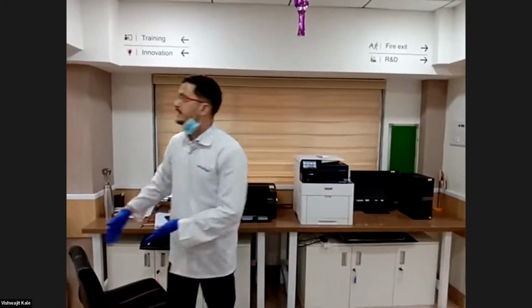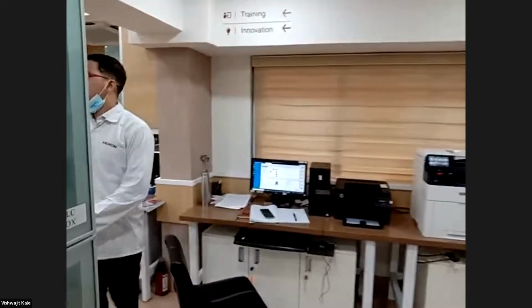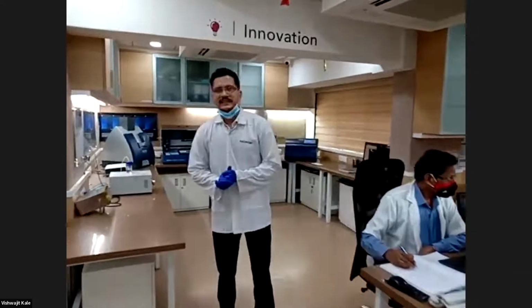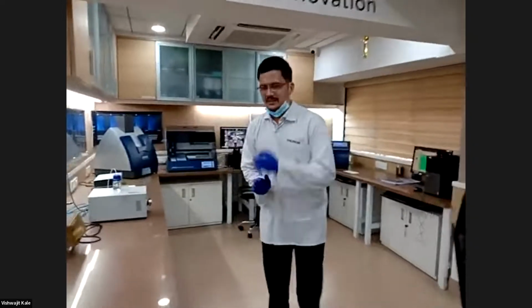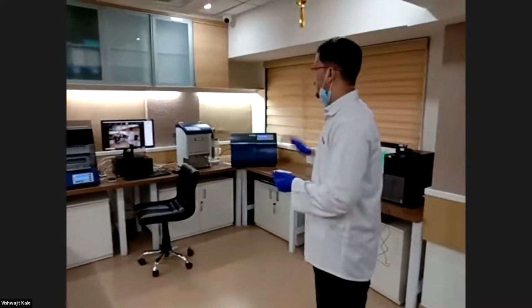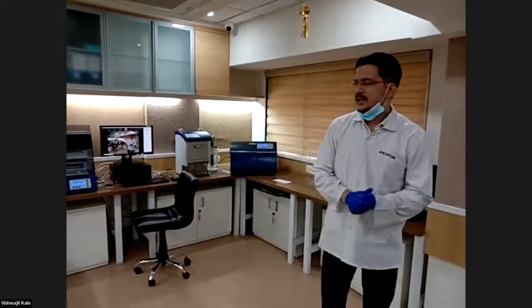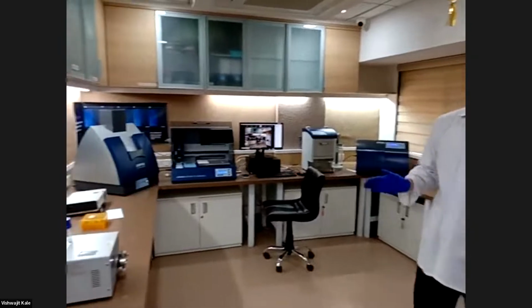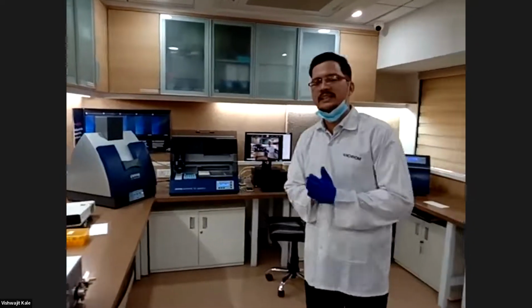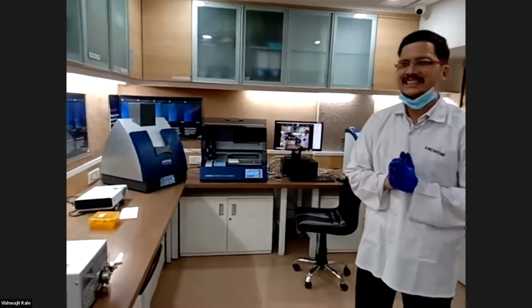So we are entering into the innovation area of the Anchrom laboratory in Mumbai. Here you can see all the CAMAG HPTLC modules. And as sir told, it is a modular system. There are different modules allotted to perform each step involved in HPTLC analysis.